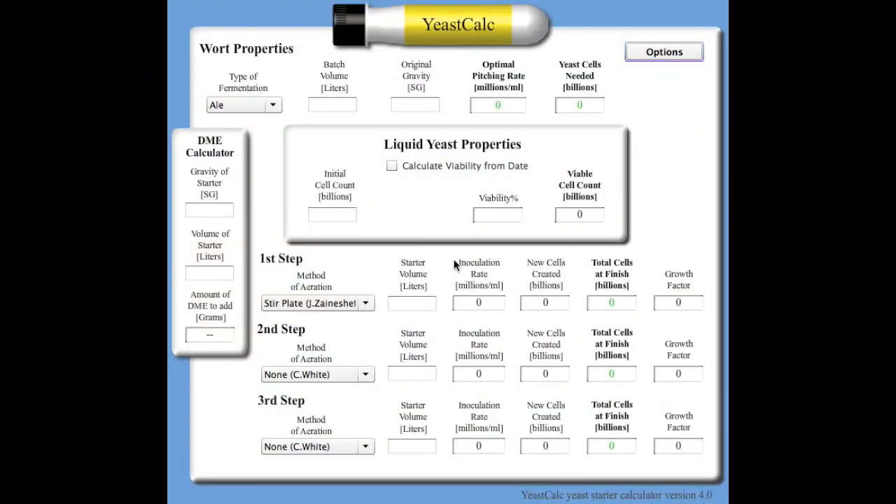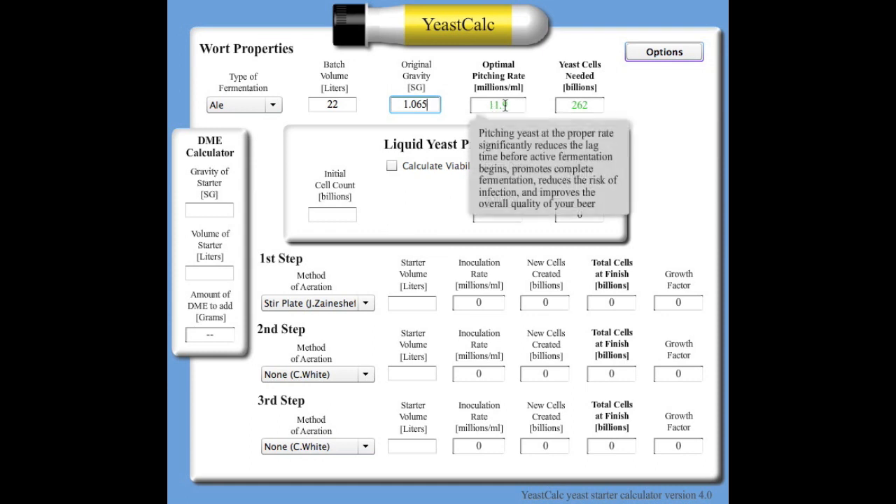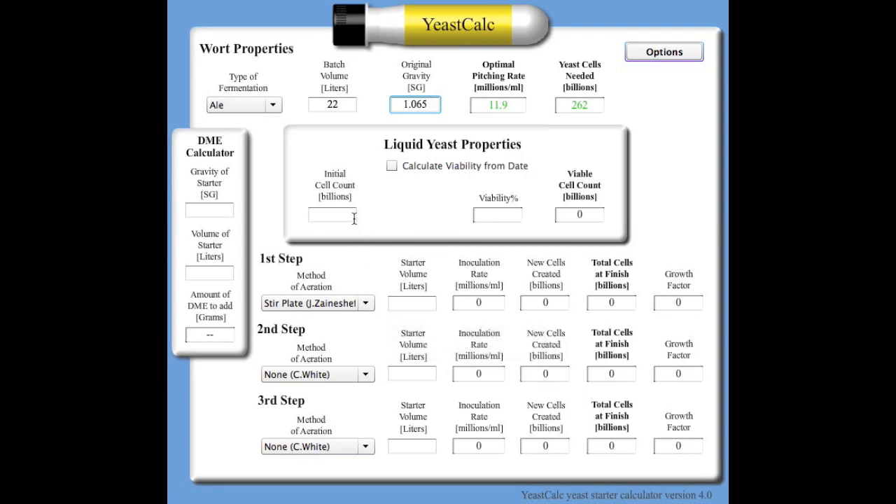Now that we have 93% viability and approximately 175 billion cells, we know 93% of those 175 billion are viable. With that information, I go to another calculator called YeastCalc — I'll put all the links below. Here we go: first, select your fermentation type — ale, lager, or hybrid. For this example we'll do an ale. Set the batch size to 22 litres and the gravity to 1.065. This tells us we need 262 billion cells at 11.9 million cells per mL of wort. Enter 175 billion cells and 93% viability — that gives us 162 billion viable cells, which is about 100 billion short.